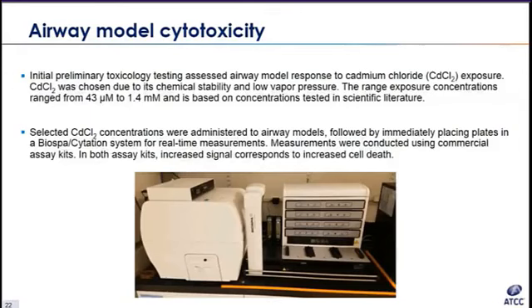Following these functional studies, we began exploring how well these models will react to exposure to toxins. Right now, we're in the process of conducting toxicology screening assays using mature airway models. However, I can share some of our preliminary work using undifferentiated primary cells grown in transwell inserts.